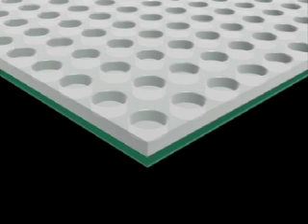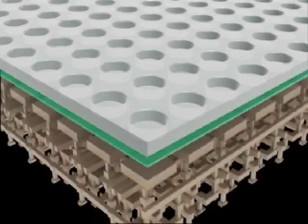Each well holds a different DNA template. Beneath the wells is an ion-sensitive layer and beneath that a proprietary ion sensor.